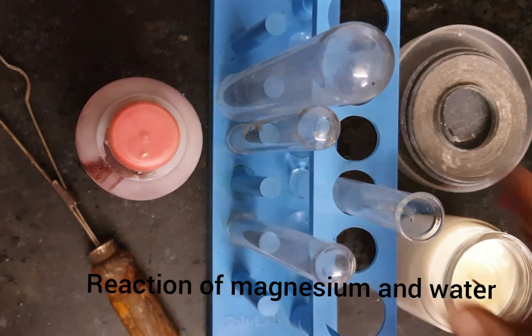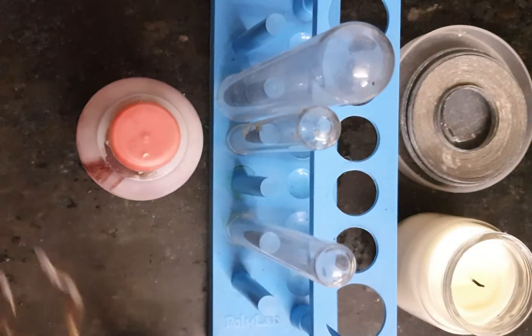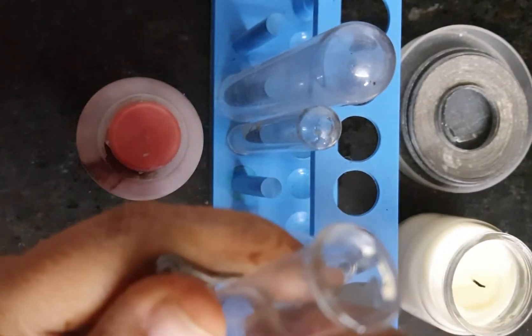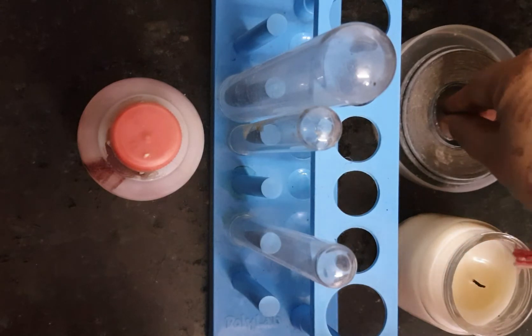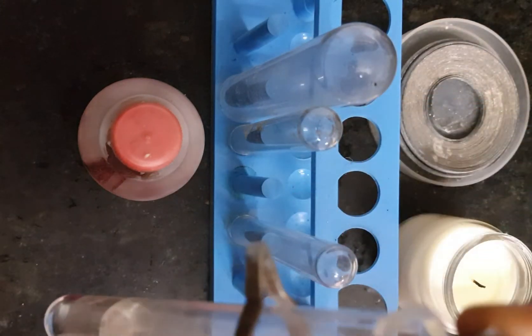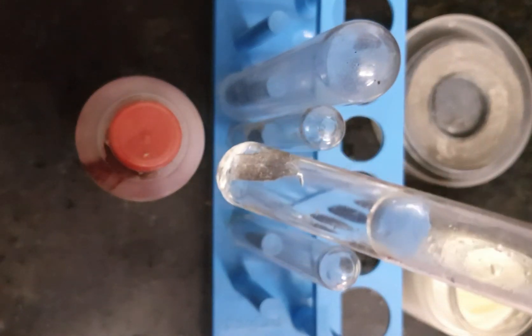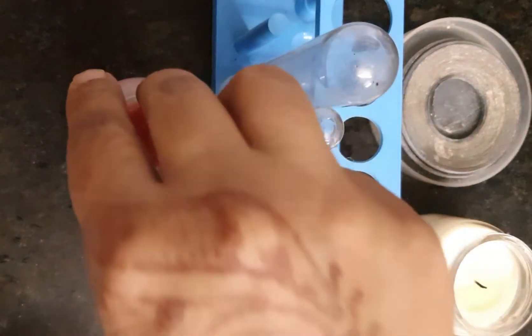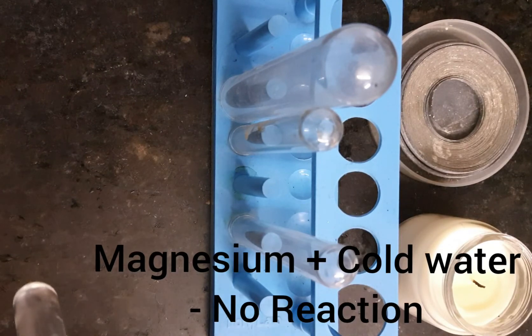To start the reaction, we will take some water in the test tube and fix it in the test tube holder. We will take a small piece of magnesium ribbon and put it in. Let's see if there is any reaction. We know water is neutral, so it should not turn red litmus to blue.